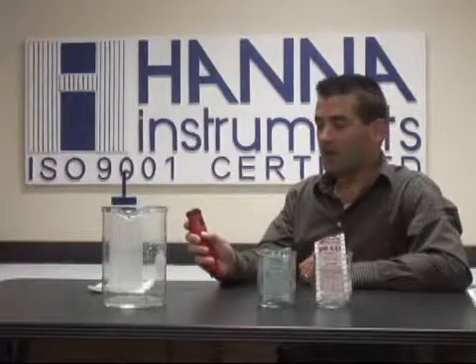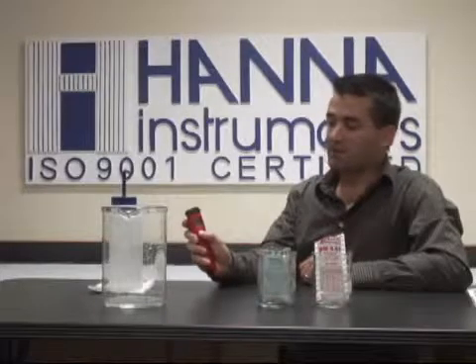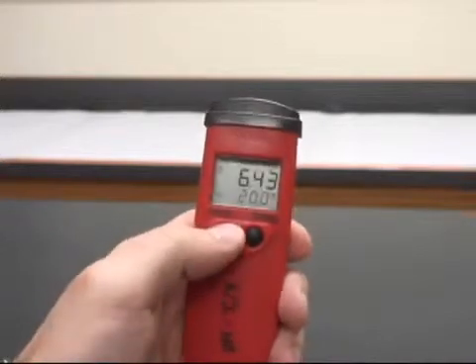What we're going to do to go into calibration mode and calibrate this tester is we're going to hold that mode button down until we see it go through off into CAL or calibration mode, and then we're going to let go of the button.